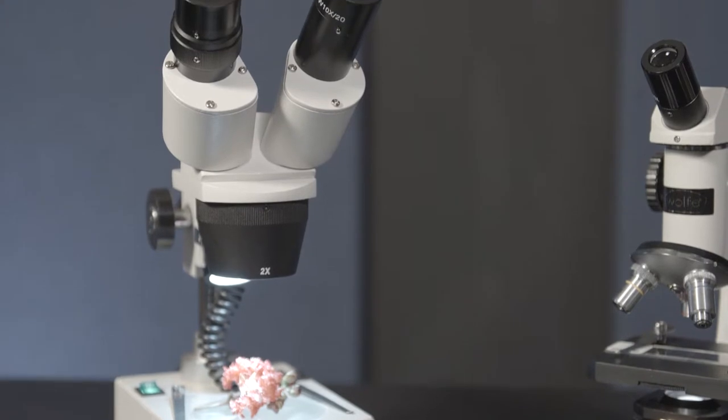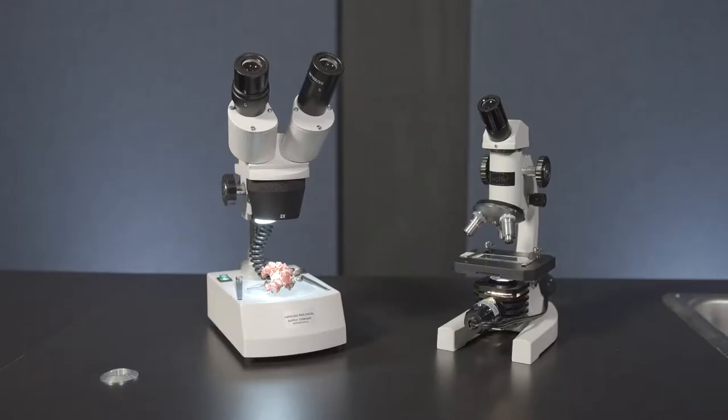This video will focus on compound microscopes specifically designed for entry-level students in elementary and middle school classes.